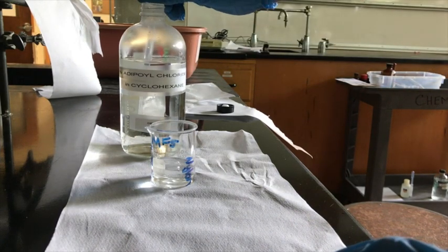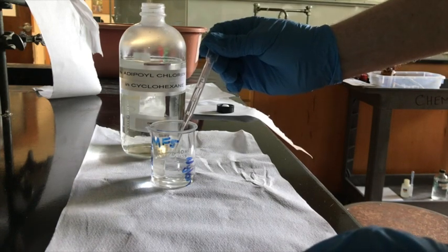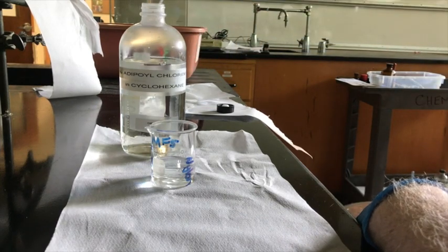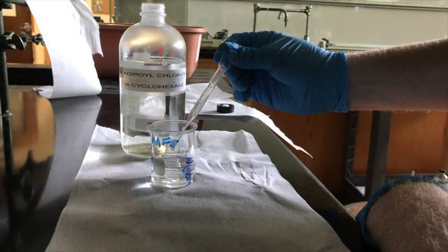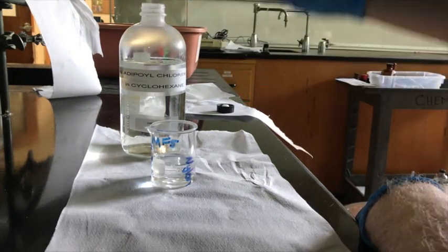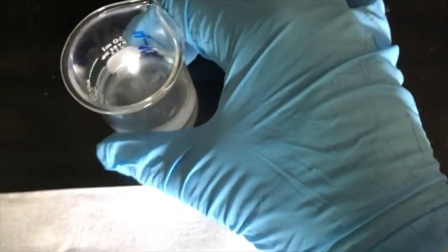And I kind of cheated. I added more than 10 milliliters initially of my aqueous solution. I was supposed to add 10 according to the procedure, but I wound up pouring about 15 milliliters. So maybe I'll go to about 30 right now, so I have an equal volume of the two solutions. Let's see, can you see that polymer film between the two layers? It's maybe a little bit hard to see. Maybe if I come from this angle, on the black background. Yeah, I think I can see it. See that? There's a layer of nylon that formed between the aqueous and the organic layer, aqueous layer on the bottom. So we're going to hook into that and pull out a thread of nylon.